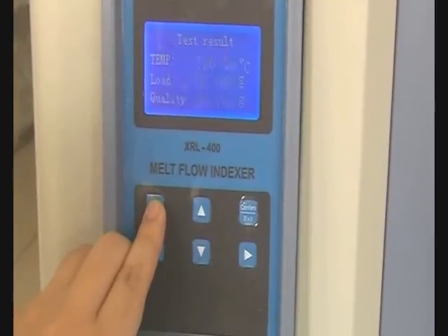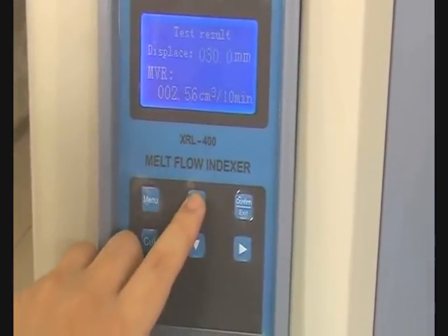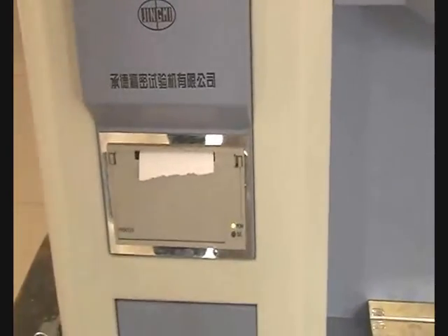Press up and down keys to select how to output the test result. If you just want to check the result, press menu. If you want to print the result, select it, then press menu. It will print automatically.